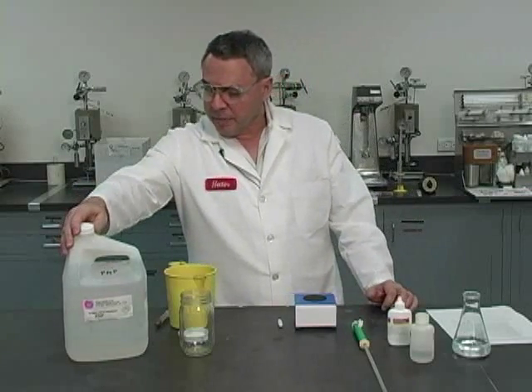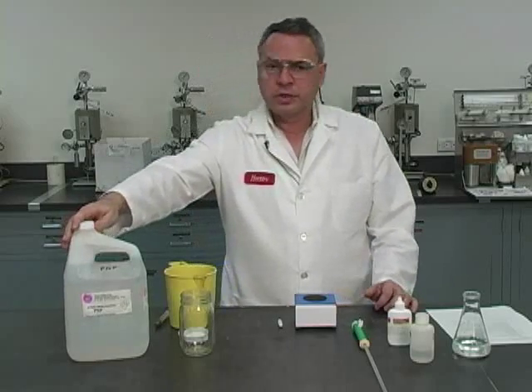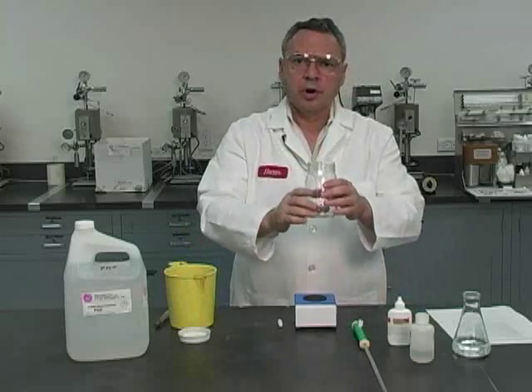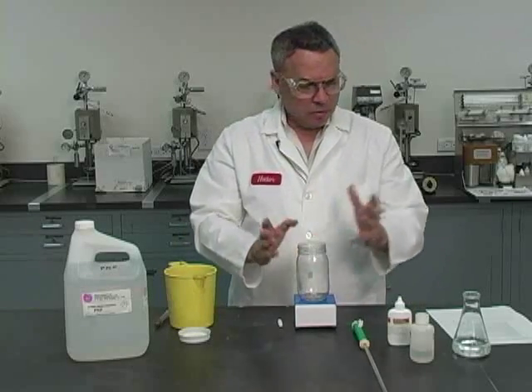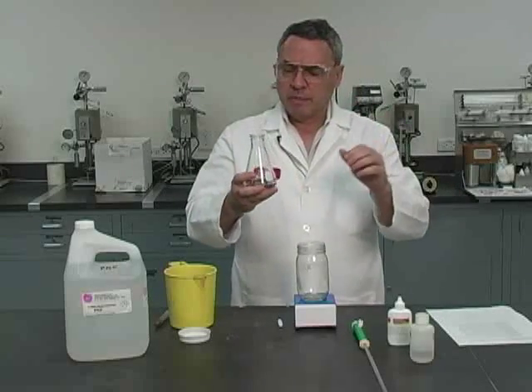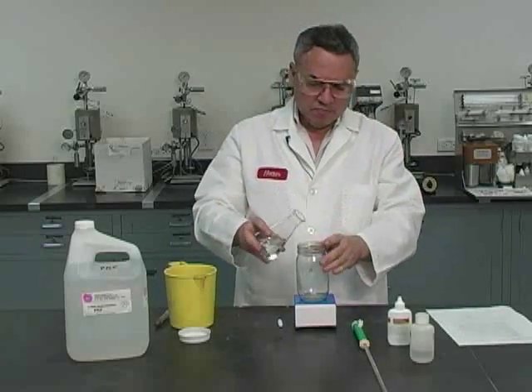Also, we have here NPP, which is normal propoxypropanol. As a matter of fact, we are going to do the analysis in this jar, and I'm going to start by putting approximately 100 cc's, which I already measured, of the NPP.